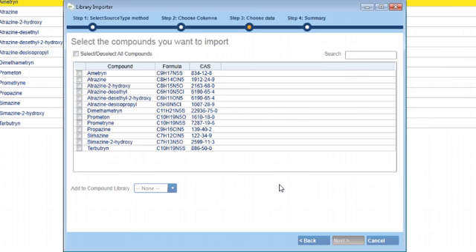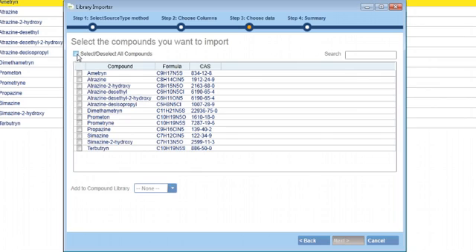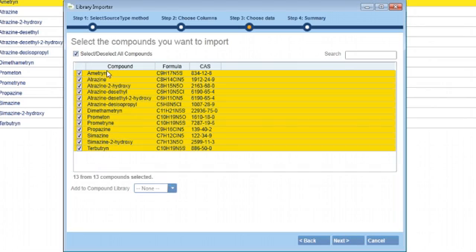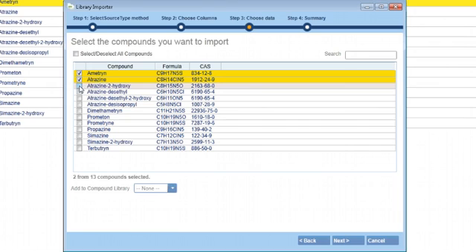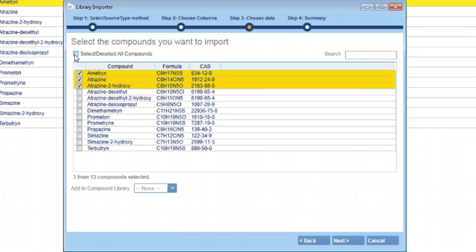Once you select the library, a dialog box will open listing all the compounds in the library. You can select all compounds using the top left checkbox, or select individual compounds to import. We'll import all of the compounds in this example.